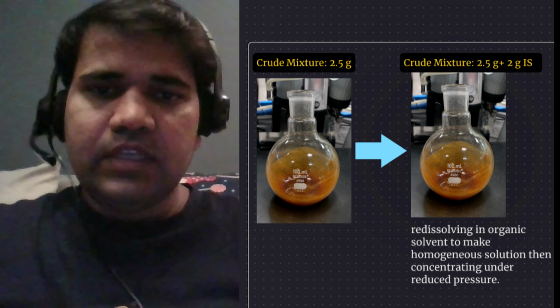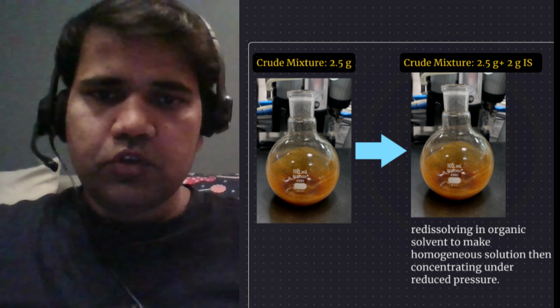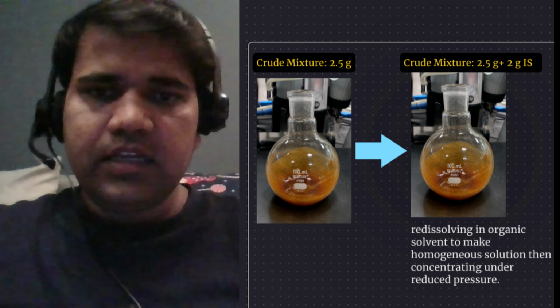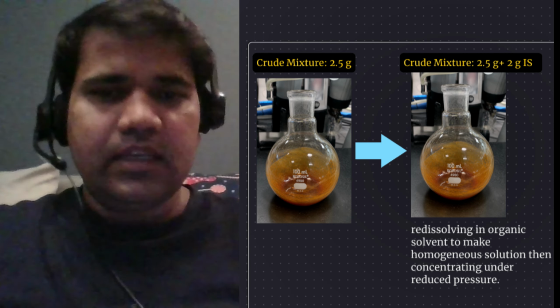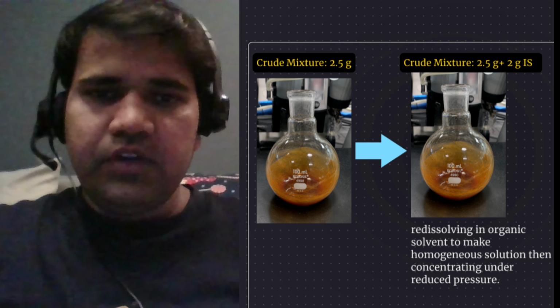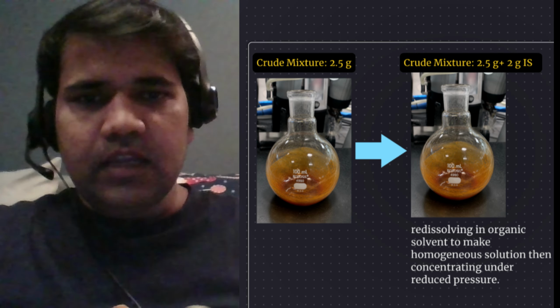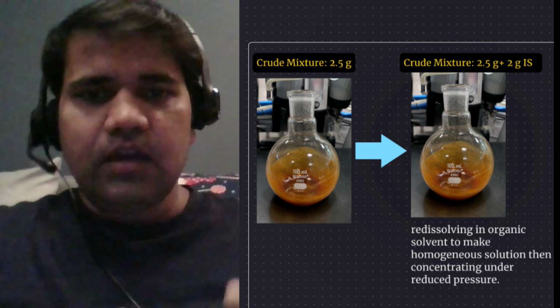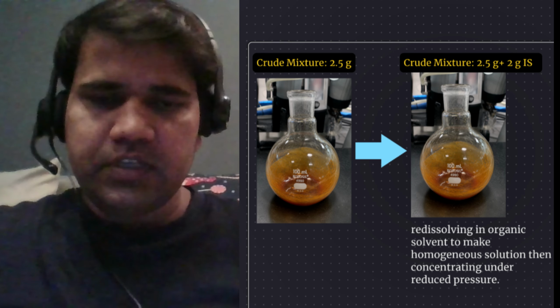Now whatever NMR yield you get after using all those formulas will be directly connected to the whole reaction mixture. So in that case, you are not doing any scaling, but the problem is that you are using a lot of internal standard, and when you do purification, you have to get rid of that internal standard, which will take your time and more organic solvents during the purification.